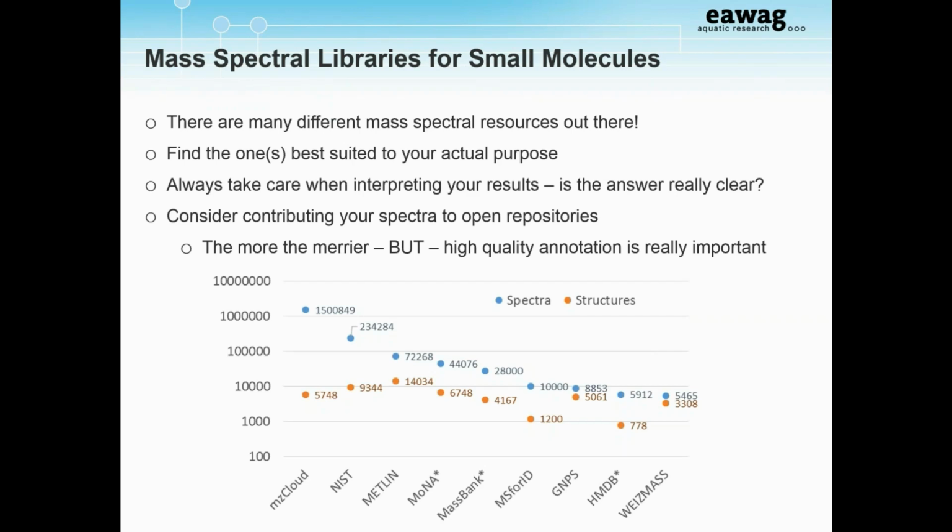Here's a question that relates to that. What is the easiest workflow to clean up your own spectra and get them into a database, local or open? What is the easiest workflow?